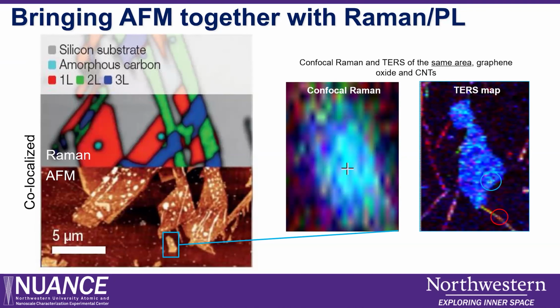So obviously, we don't know whether it's a single tube or a bunch of tubes. We are getting a contrast here because of the diffraction, so basically you cannot resolve to a pretty low resolution. But on the right, you can see a TERS map where you can easily identify either 2D materials or carbon nanotubes and all those things. So it's a pretty useful technique to do that.